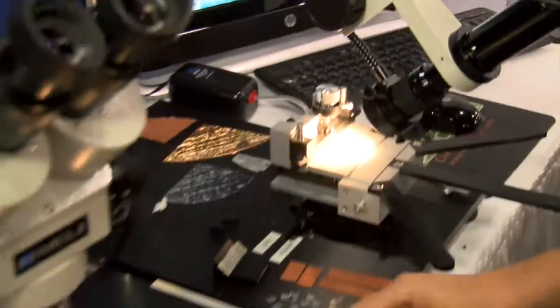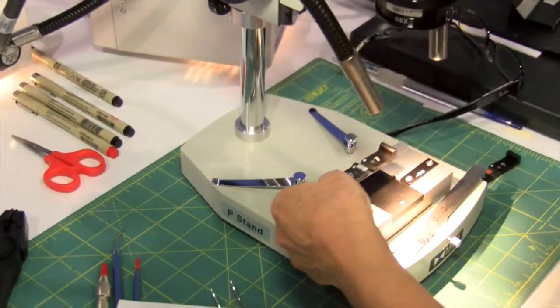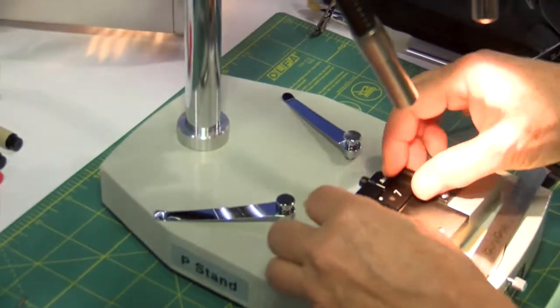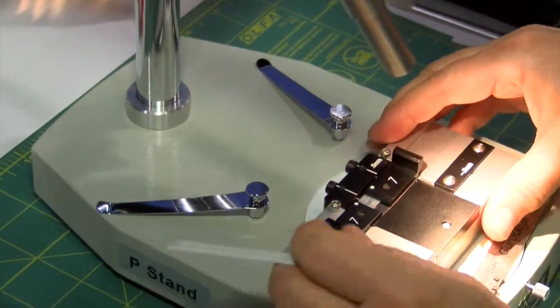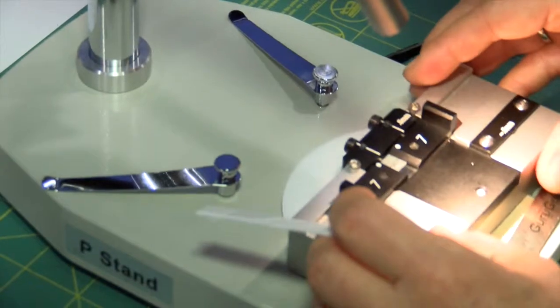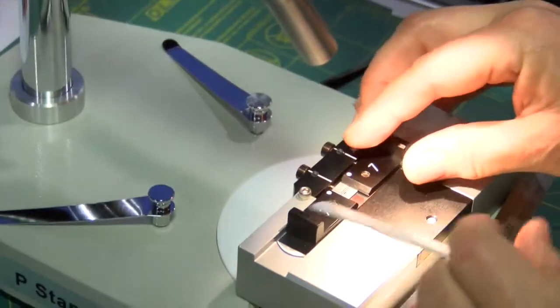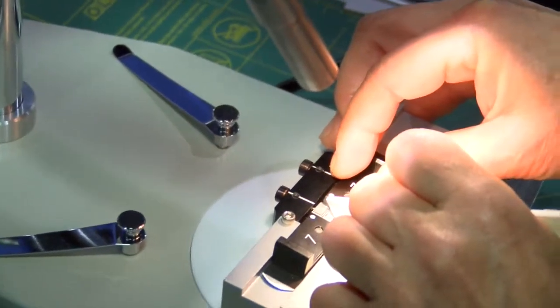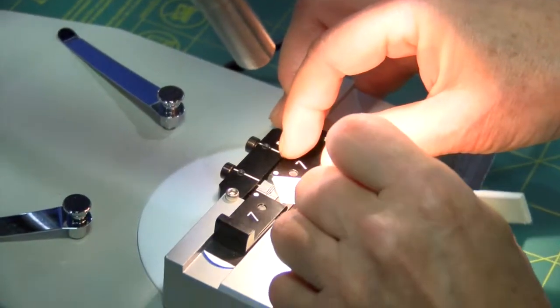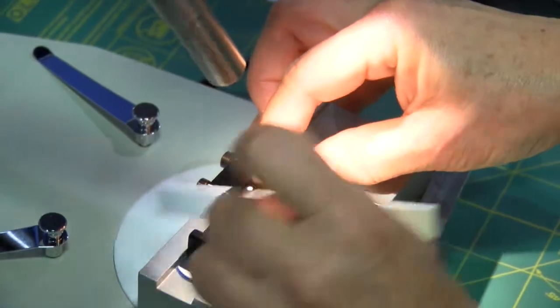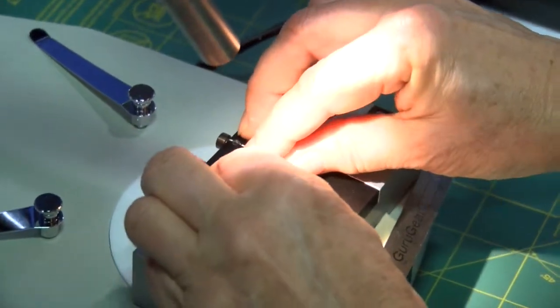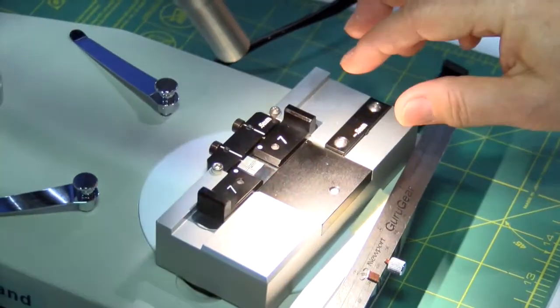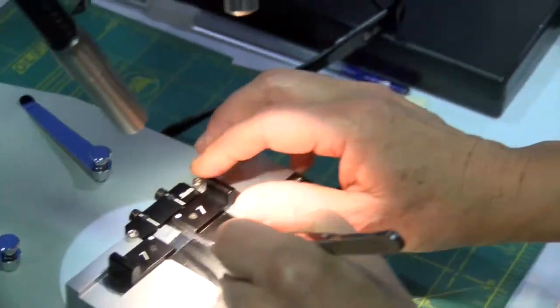Now after indentation was made the sample is moved over to the small sample cleaver platform. The indentation is aligned with the stage pin and once the indentation is over the stage pin there is a light pressure on the sides of the sample on the hold downs and the sample is cleaved.